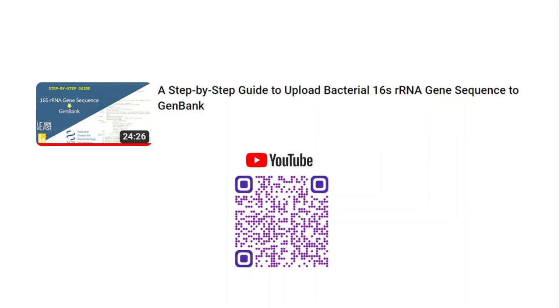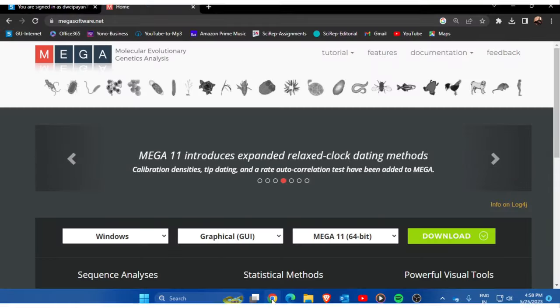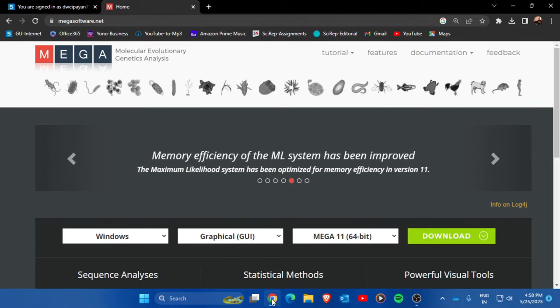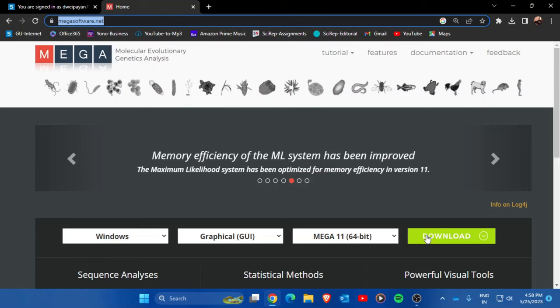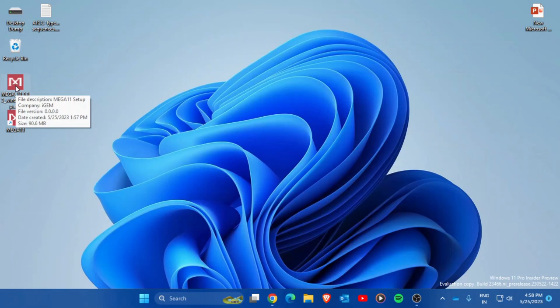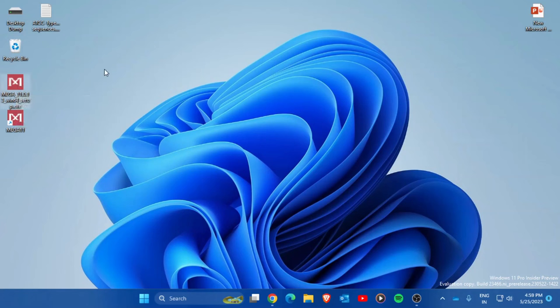The first thing you will need is the MEGA software. The current version is MEGA 11, available at megasoftware.net. Just download the file from there — the installer is around 90 megabytes. Install the software by double-clicking and pressing Next every time it prompts you. It's a very easy installation process.